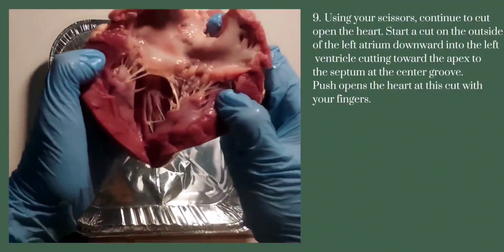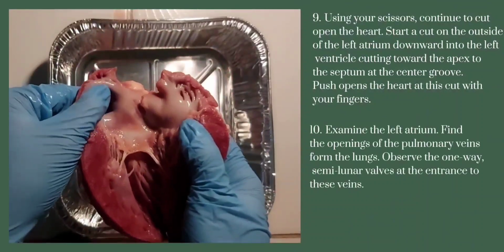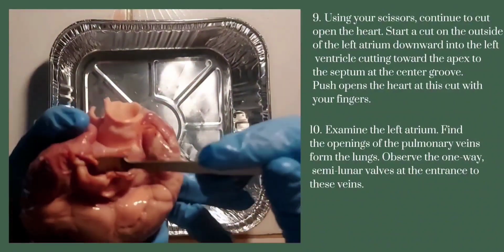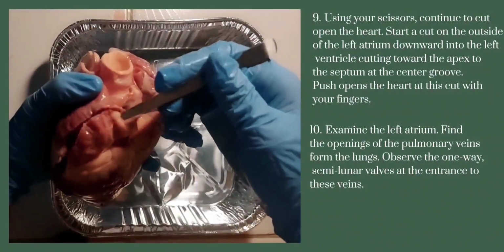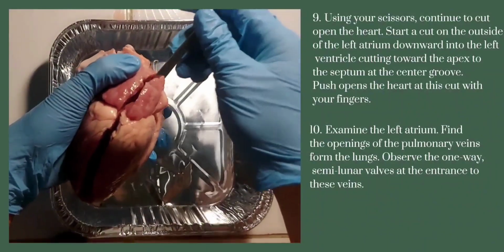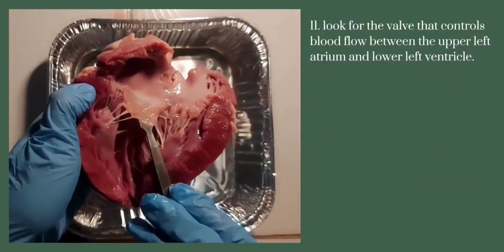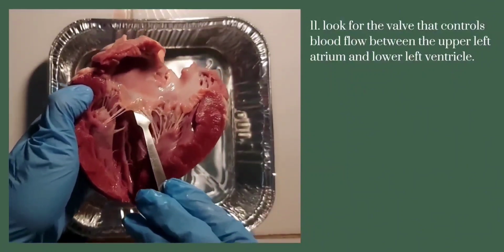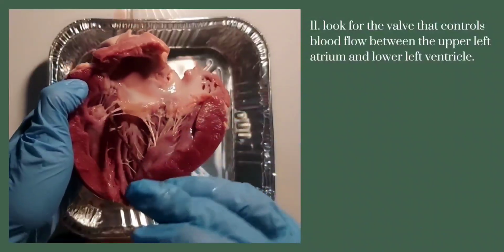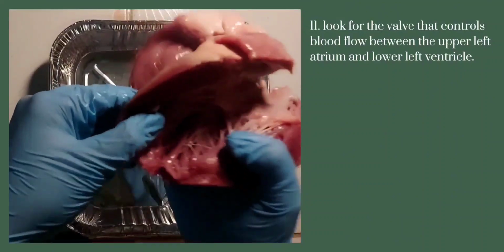Push open the heart at this cut with your fingers and rinse out any dried blood with water. Examine the left atrium. Find the openings of the pulmonary veins from the lungs. Observe the one-way semilunar valves at the entrance to these veins. Inside this chamber, look for the valve that controls blood flow between the upper left atrium and lower left ventricle. This valve is called the bicuspid or mitral valve. This valve consists of two leaflets and blood flows from the left atrium into the left ventricle during diastole.